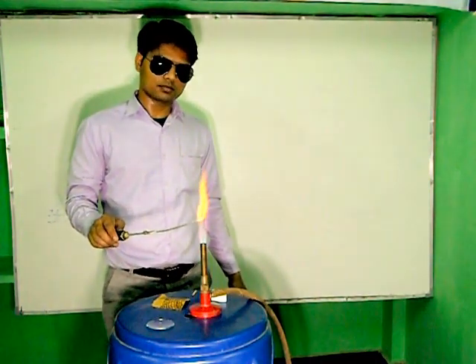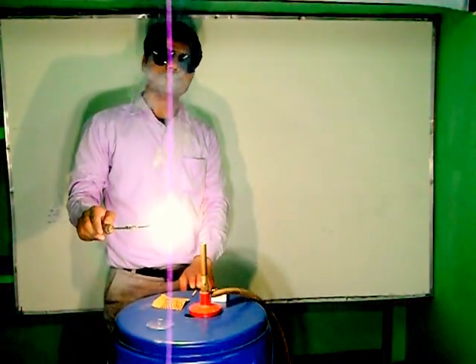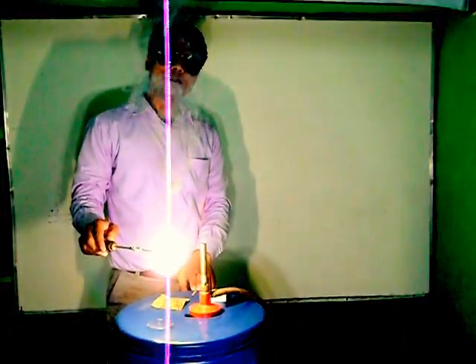See what happens. It burns with white flame. See.